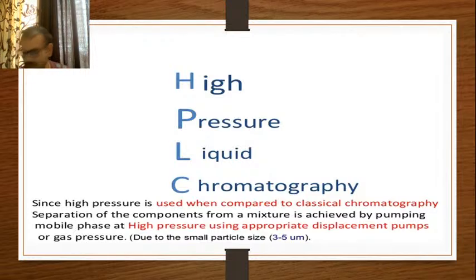And the third question: is there any similarity between the photodensitometer and your HPLC? I haven't found any link regarding HPLC and the densitometer. So I don't know why this question has been raised. I'm not getting the logic behind it. So why is this question there actually?